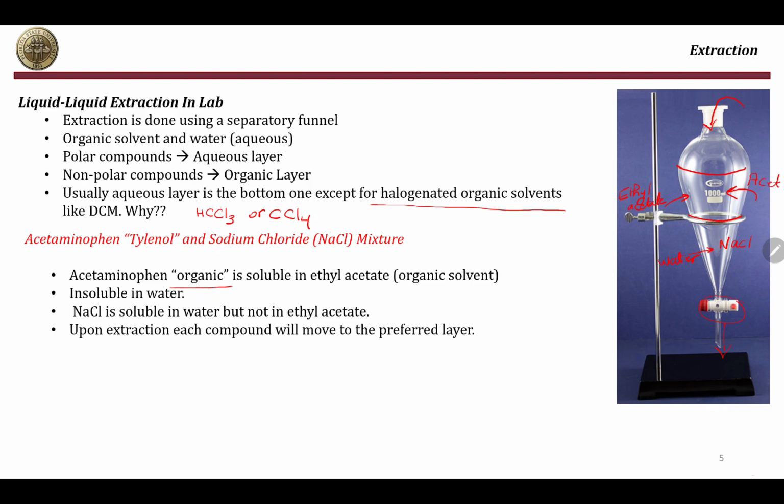And this is how we can achieve the separation between acetaminophen and NaCl. Once NaCl and acetaminophen have moved to their corresponding layers, by just opening this tap, I can drain the bottom aqueous layer, and this is how I separate my sodium chloride from acetaminophen.